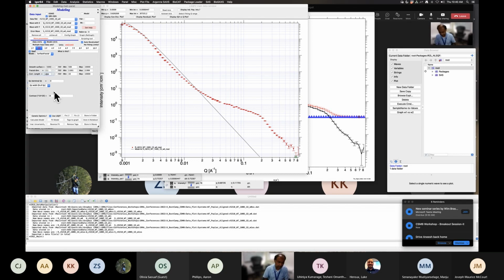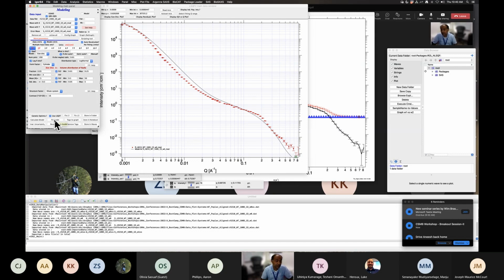Okay, so let's make that 50. I want the curvature, and I need to go up again. So I play with it. So I just want to capture as much as I can. And it's possible I may not capture it well, but then I add it with this. And now you can see, okay, there's some resolution. Now it's not perfect, right? But we're going to try to fit this and see what happens.